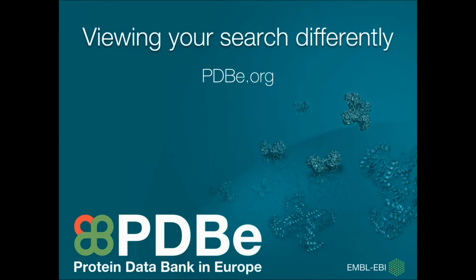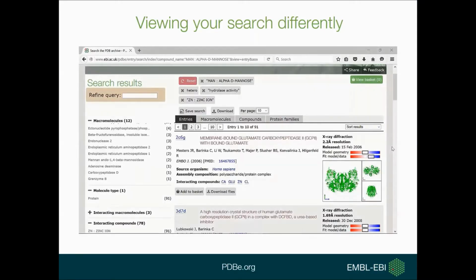At the PDBE, we're moving away from the more entry-centric search results. I'll show you how you can view your search differently here. So above the search results, you have these 4 tabs for entries, macromolecules, compounds, and protein families. I'll begin to talk firstly about our entries view.